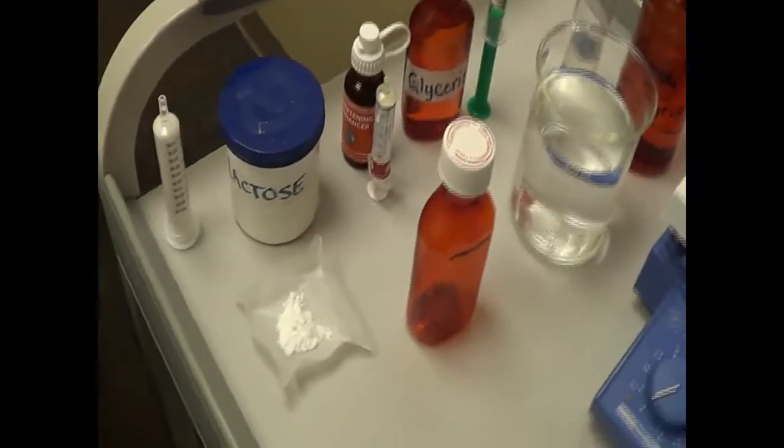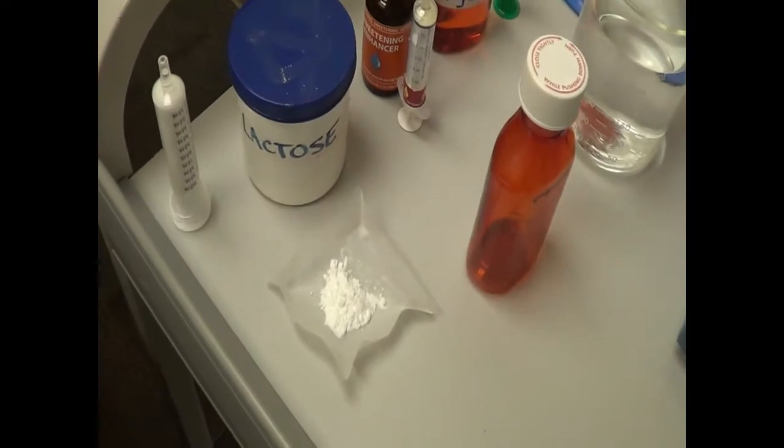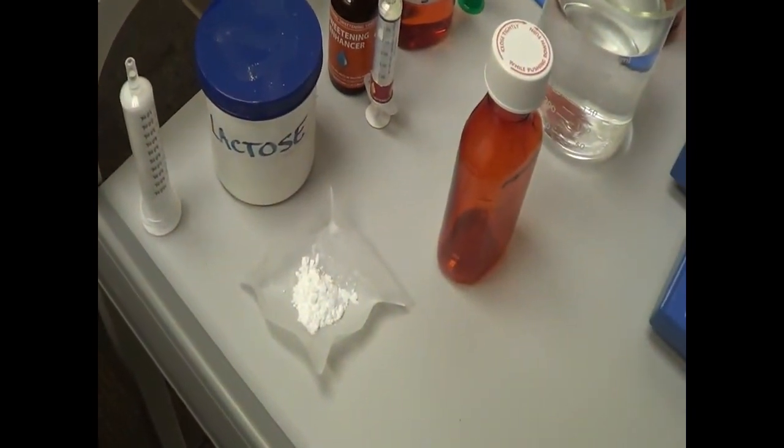In this particular drill we are using lactose — 250 milligrams or 0.25 grams.